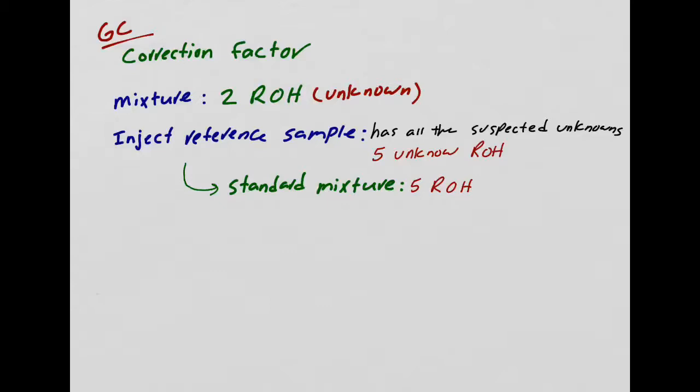Also, this is key. This standard mixture has equal volume of all the alcohols. And that's key. Because remember what we said?